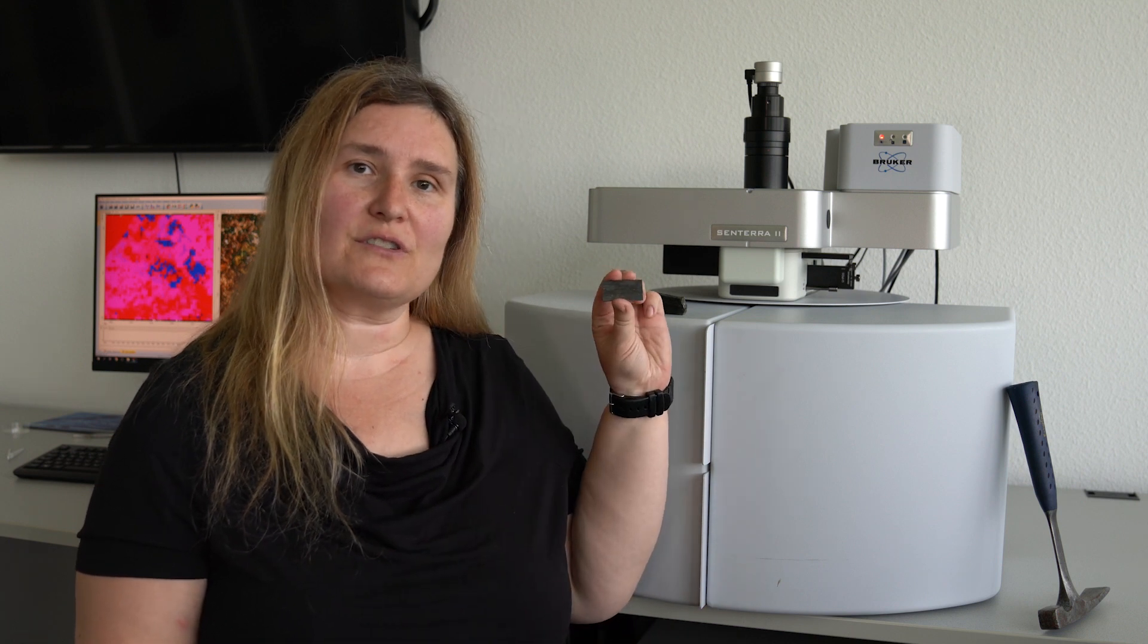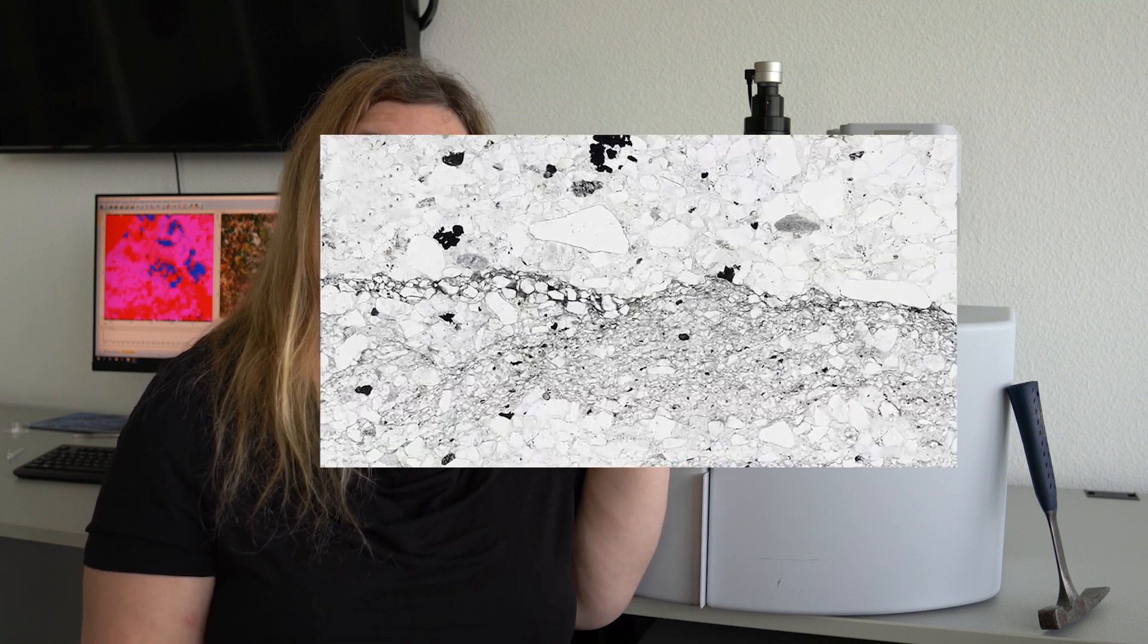Let us now move to a much faster Raman application. For that, we are moving into the research sector using the Sentera II Raman microscope. We are going to look at another very intriguing sample from early Earth's history: sandstone containing ancient microbial mats.